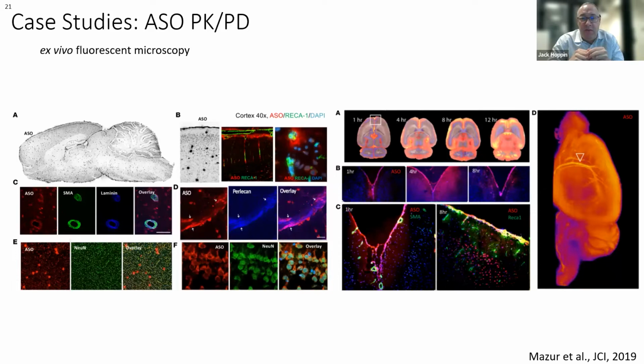So you can see the ASO plus some counterstains. The image on the left looks at a separate cohort with the same dosing, where no CT was performed, but we knew where to look and what to look for, and could put it under the microscope.